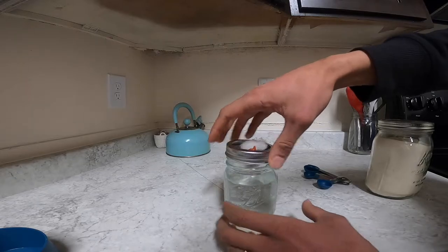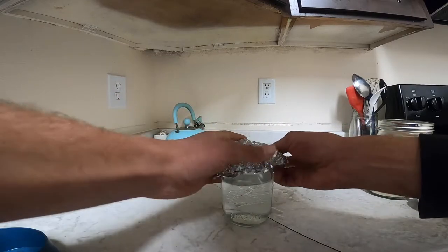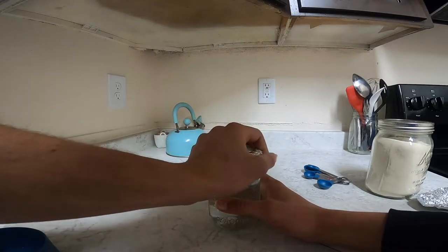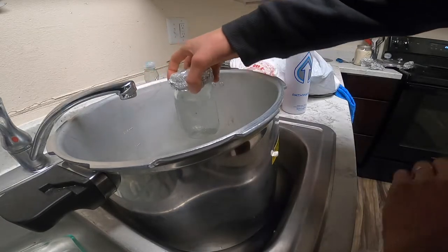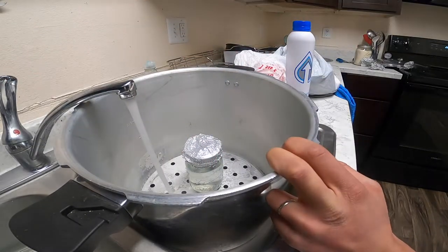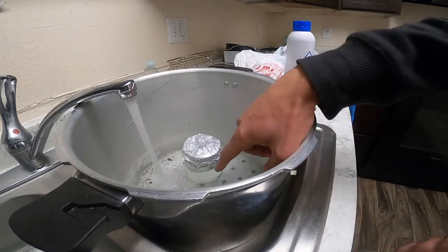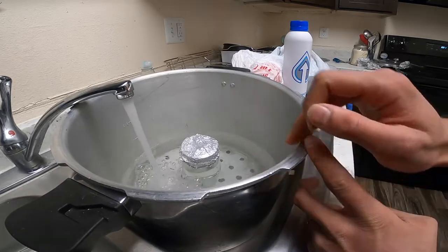Once it's stirred up you can put the lid back on. We're going to put the tinfoil on just so that the mixture stays safe inside of the pressure canner. We set our liquid culture in the pressure canner and we're going to put it on hot water so that it heats up faster. We're just filling up the water until it's at about the same level as the water inside of the jar. That should be good.